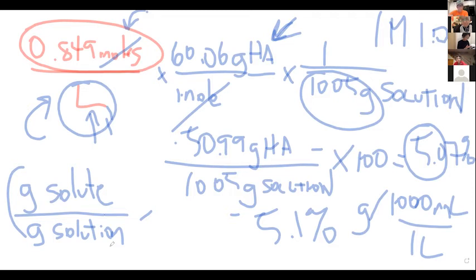I'm sorry, what, the volume of the vinegar? Yeah, the volume of the vinegar has nothing to do with how many significant digits there are in the hydroxide. You want the smallest number of significant digits, for the volume of the vinegar. No, density. That has nothing to do with the hydroxide. So you have 3 significant digits in your mass, and 4 significant digits in the density. So your answer should have 3 significant digits in it.